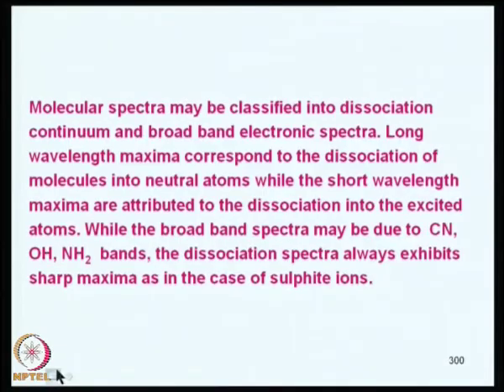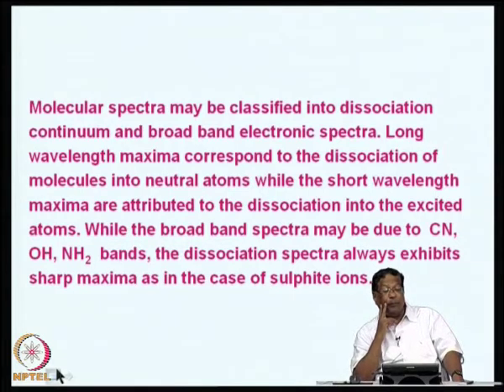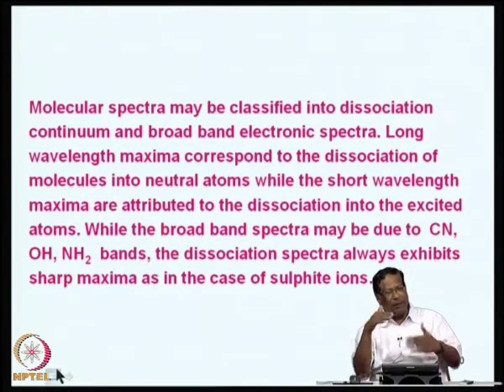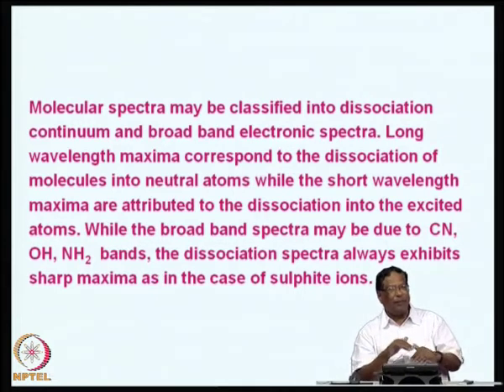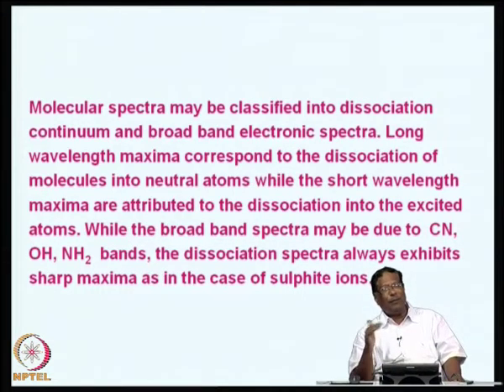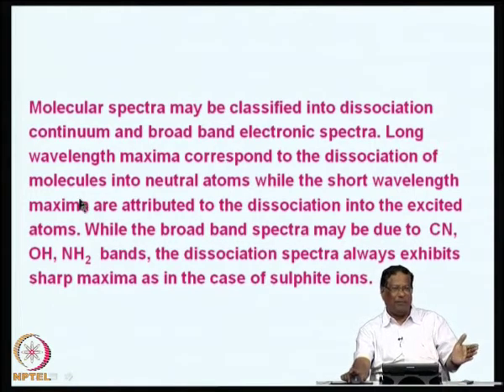So, this is one of the important aspects, and the molecular spectra may be classified into dissociation continuum and broadband electronic spectra. For example, the broadband electronic spectra, it is a structured material, it can be corrected straight away depending upon when the sample is not there, broadband electronic spectra will remain the same, provided you make the sample matching.